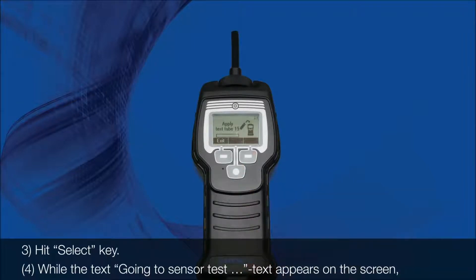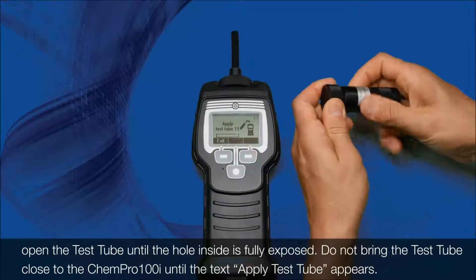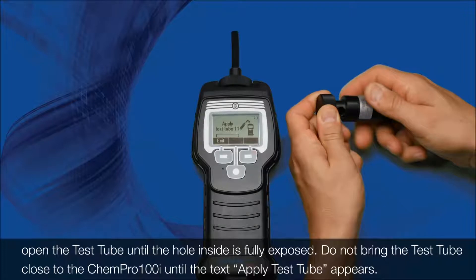4. While the text appears on the screen, open the test tube until the hole inside is fully exposed. Do not bring the test tube close to the Kempro 100i until the text appears.